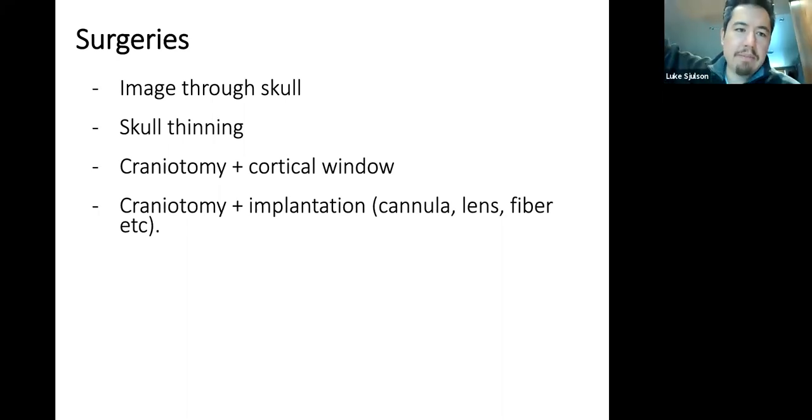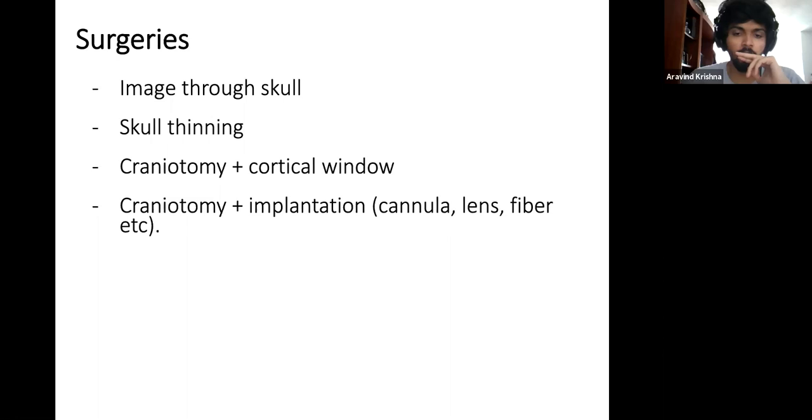Yeah, so it's not temporal integration. What it is, is that the beam hits that point in the sample at one small piece in time, and then it samples at just that time. But if you think about GCaMP as a low pass filter, you just have to oversample the frequencies of that low pass filter. So GCaMP itself is an integrator of the calcium signal. So you see what I'm saying? In that sense, you just have to oversample your indicator.